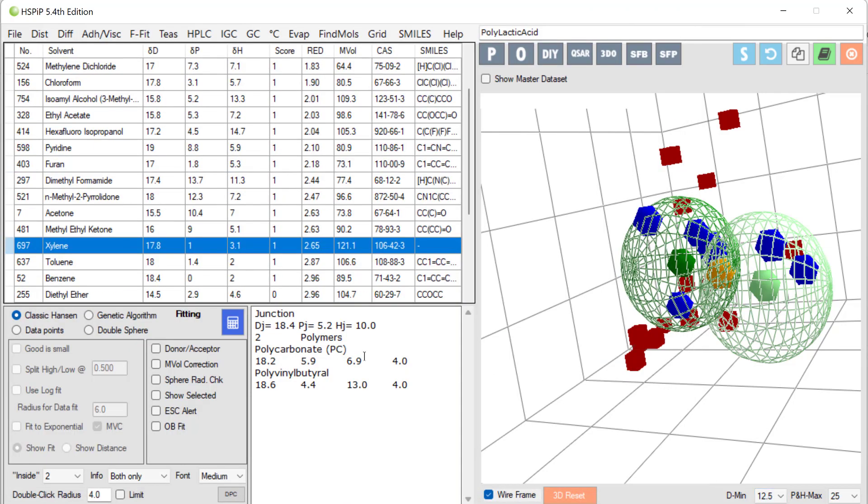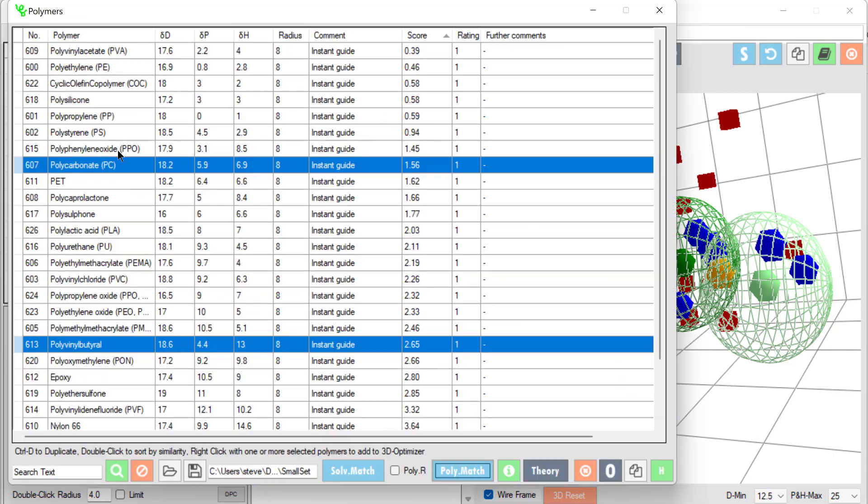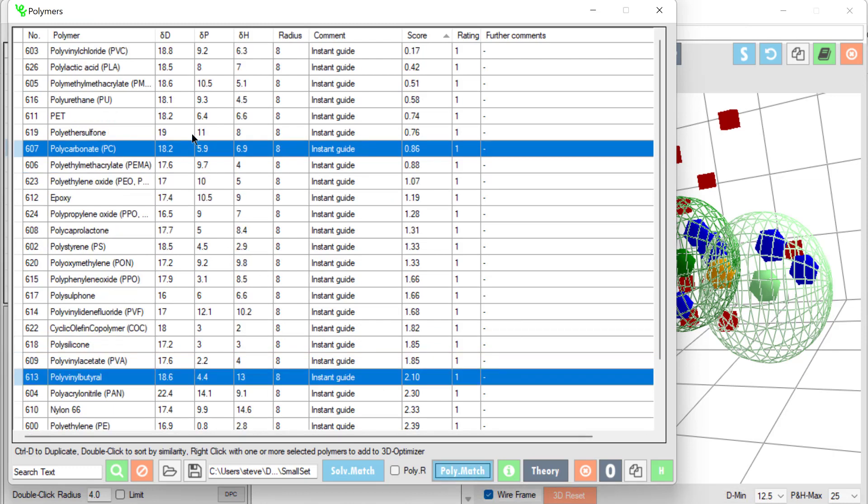If I choose a different solvent such as pyridine and do that again, polymer match, then obviously PVC, polyelectric acid are more compatible with pyridine and so forth. So you can get a good range of capabilities of thinking through your polymers and solvent matches.